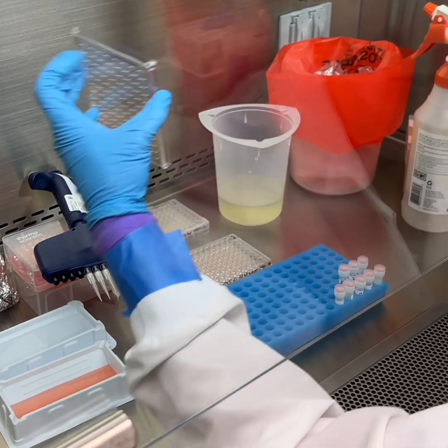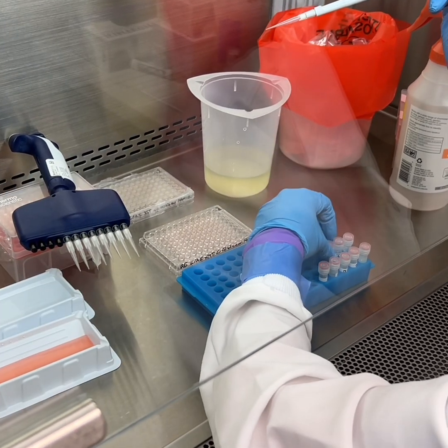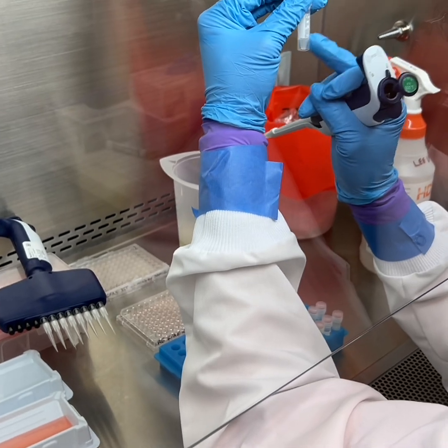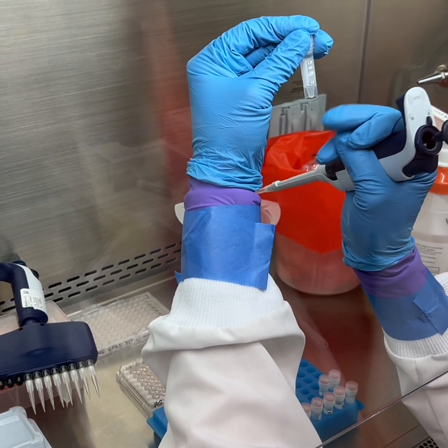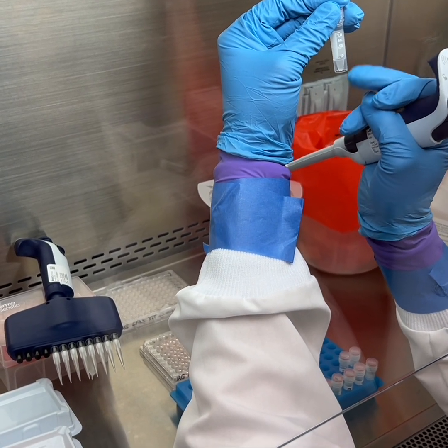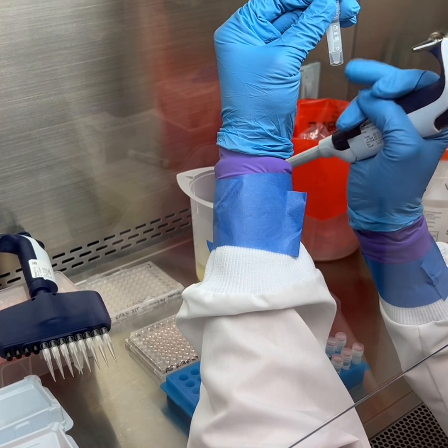All right. So now we are adding our heparin, or whatever compound you're testing. So this is about 3.3x heparin, which is about 3.3 thousand units per milliliter. I'm just mixing it, making sure it's homogeneous.